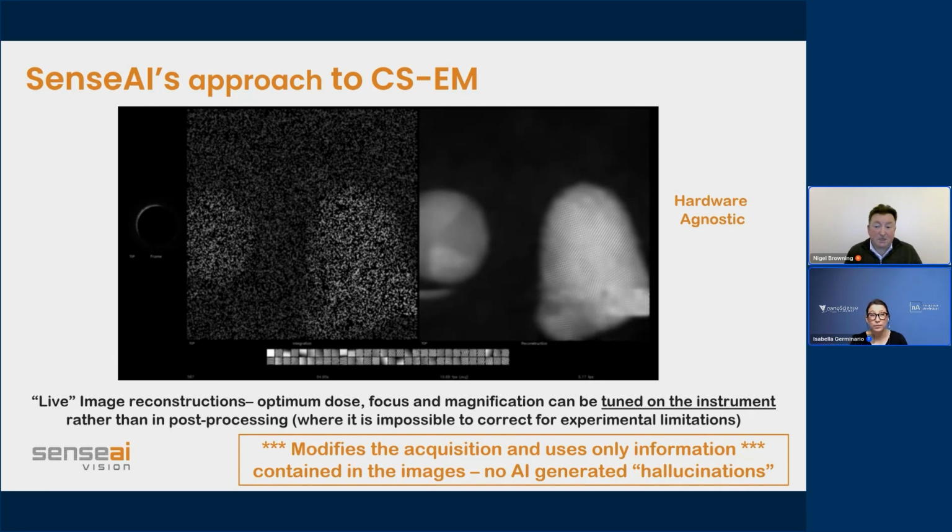So we don't actually even have to look at the physics or the math of the reconstruction process. We can actually look at the images that have come out and see that we get higher resolution, so that our 3D reconstructions that come out of our volume EM have higher resolution. It's things like membranes that are under the charging effect look like they have a single wall that's very broad, and when we go with the sparse sampling, we can see a double-walled membrane.